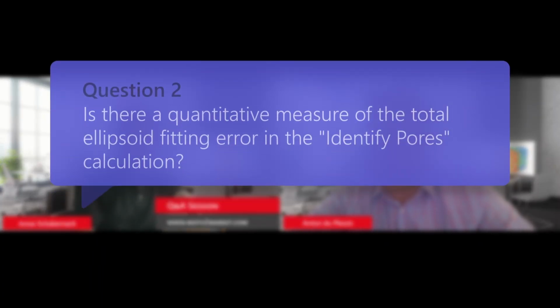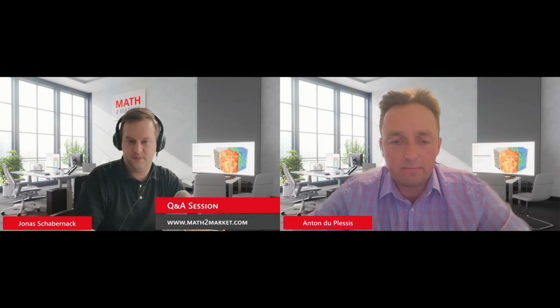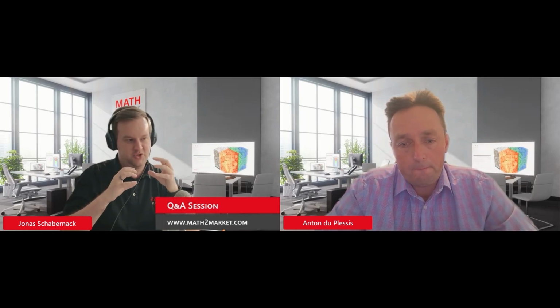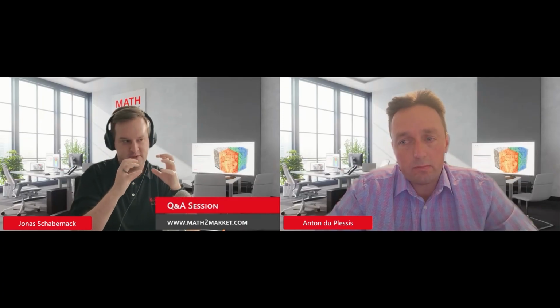Okay, there's a new question here. Is there a quantitative measure of the total ellipsoid fitting error in the identify pores calculation? One of the results is that you can visually get a difference image of the ellipsoid that's fitted to the actual pore geometry.